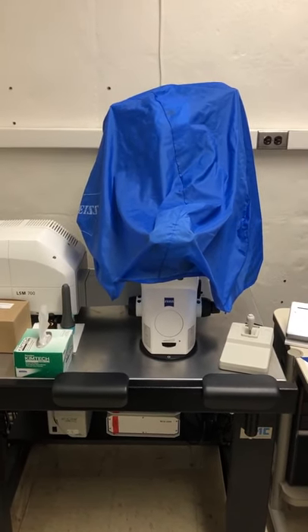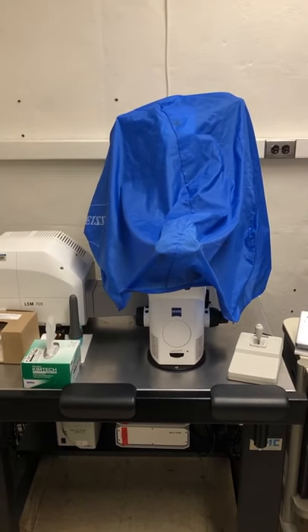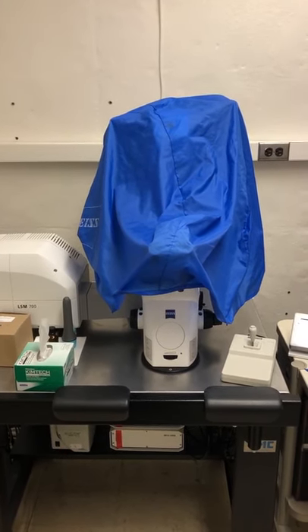The purpose of this video is to show you how to turn on the LSM 700. Hopefully this will serve as a reminder if it's been a while since you've been on the system.